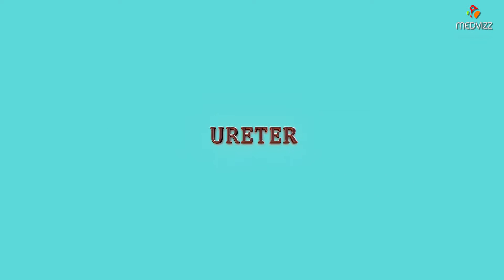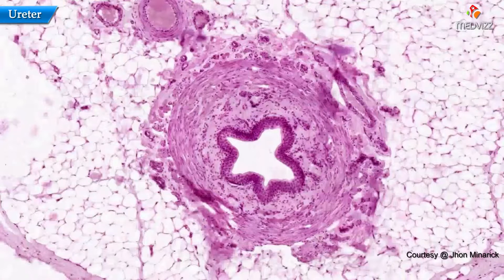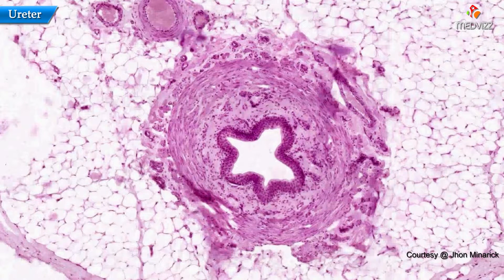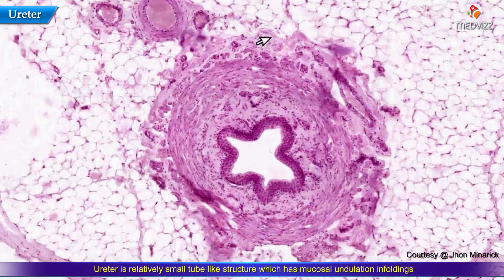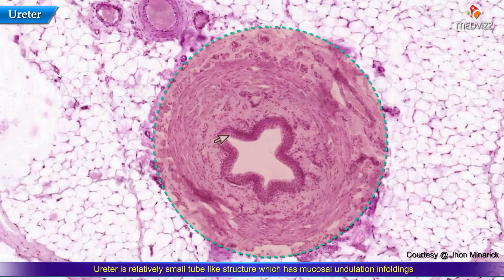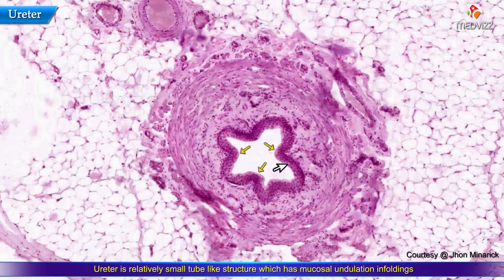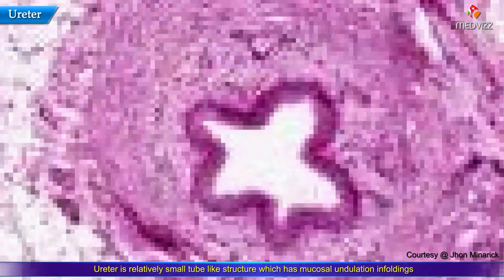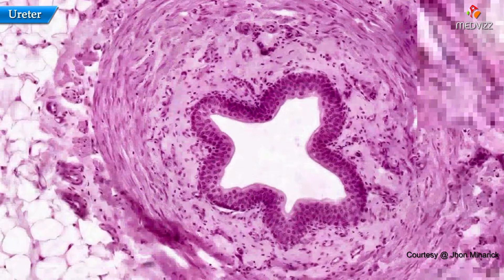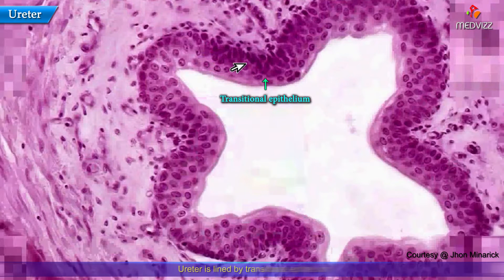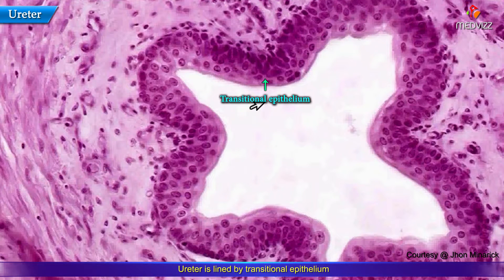This could never ever be anything else in the body except a ureter. Because it's a relatively small structure — it has a little bit of mucosal undulation or enfolding, and if you zoom in on it you will soon see this is classical transitional epithelium. This is a ureter.